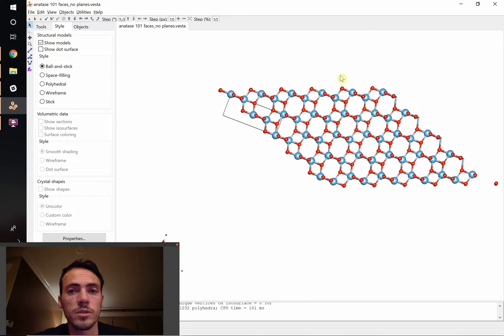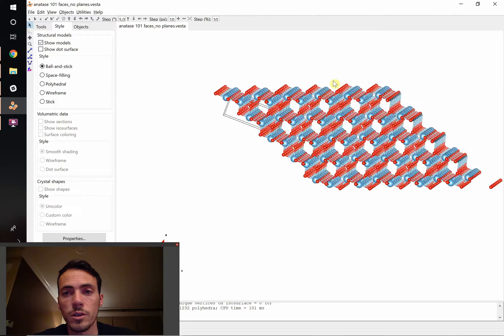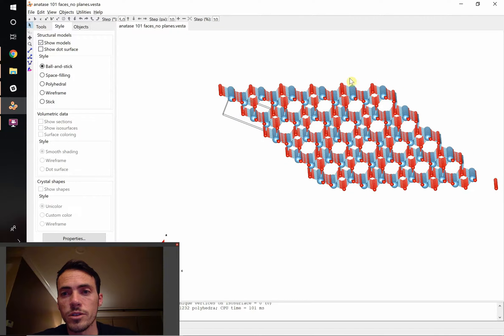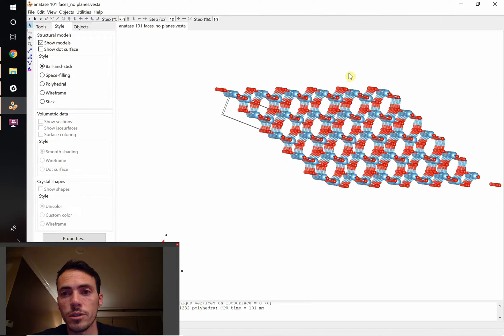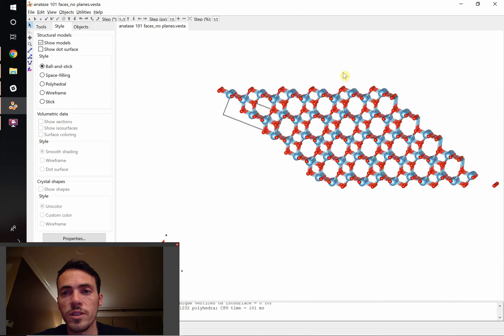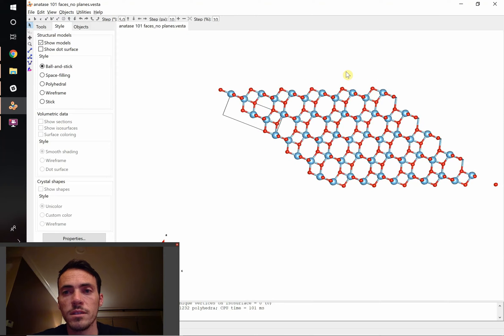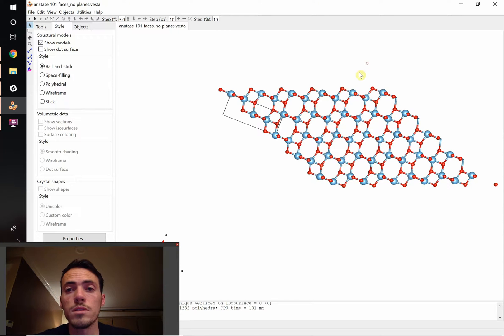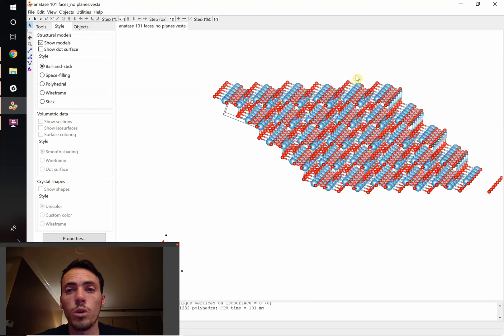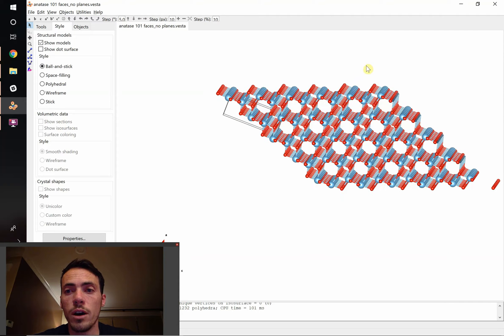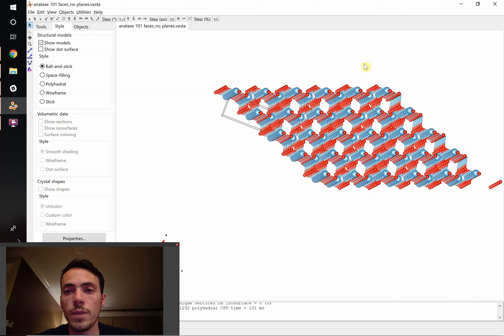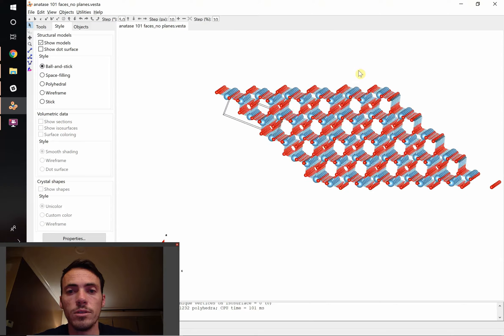For example, take a look at this one here. This is a crystal structure that user is looking for. This is the anatase titanium dioxide crystal. It's a certain type of crystal structure and he wanted to look at the 101 faces. So how do you go from that to this?